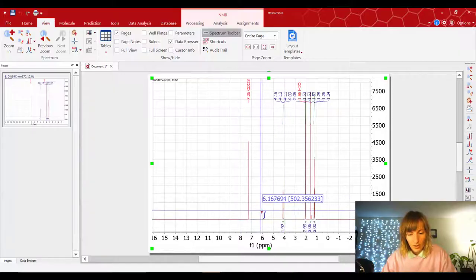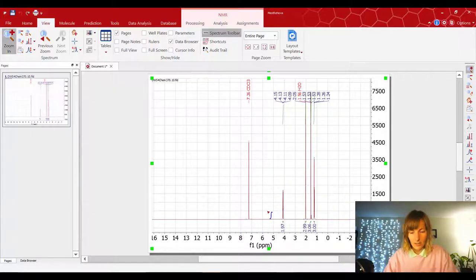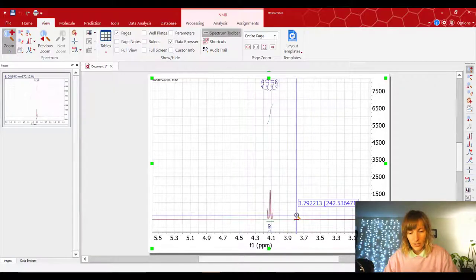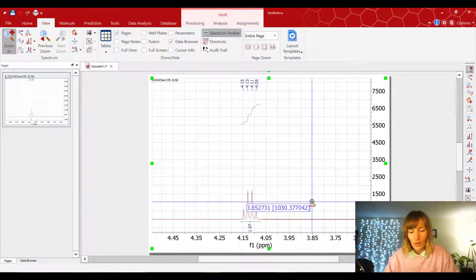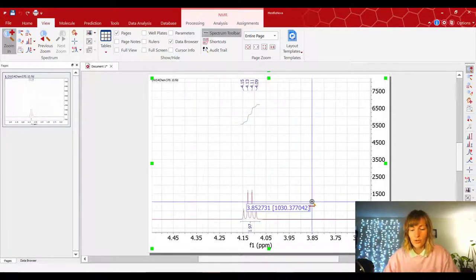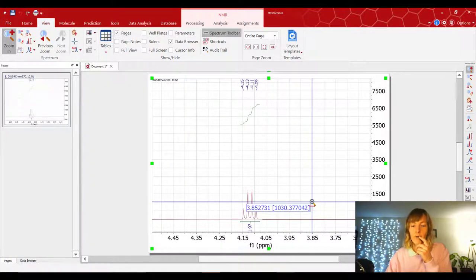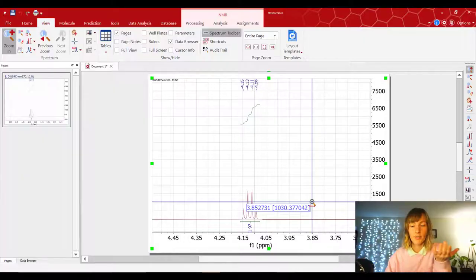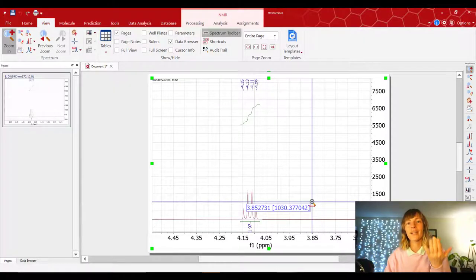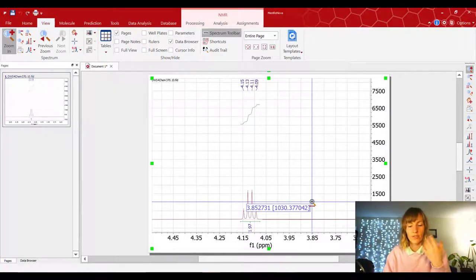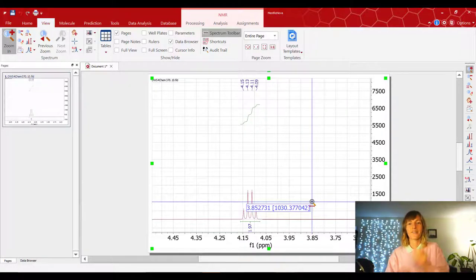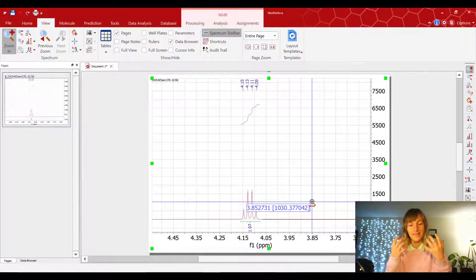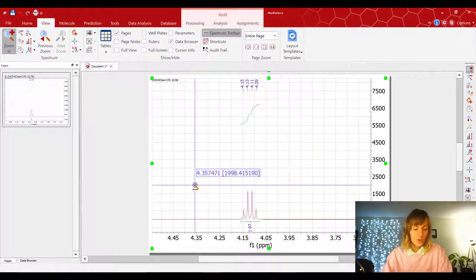And once you do that, notice that the other peak that was also integrating to 1.52 now integrates to about three as well. And if you zoom out and go back to our initial peak that we integrated, and let's just zoom in on it, it integrates to about two. So this I would say is the more correct ratio than what we had in the beginning because it's incorrect to have one and a half protons. There are no half protons. Everything is one, right? They all come in a quantity of one, not half of a proton.